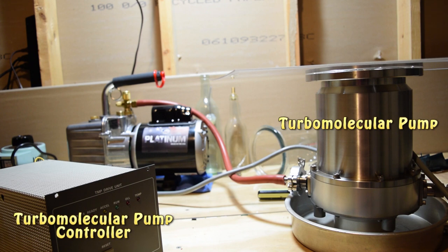So what's a turbo pump? Well, it's a type of high vacuum pump, and it requires a roughing pump to reach an initial pressure before it can be switched on. Once the turbo pump is able to be switched on, it can reach ridiculously high vacuums, and it reaches these vacuums at a surprising speed.